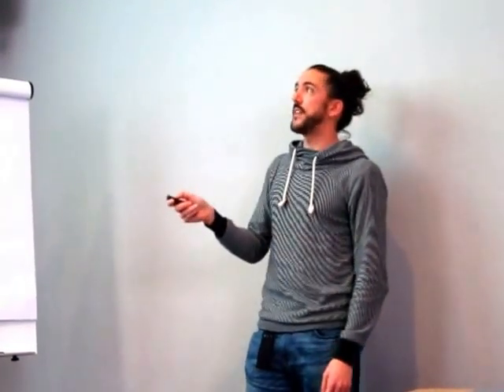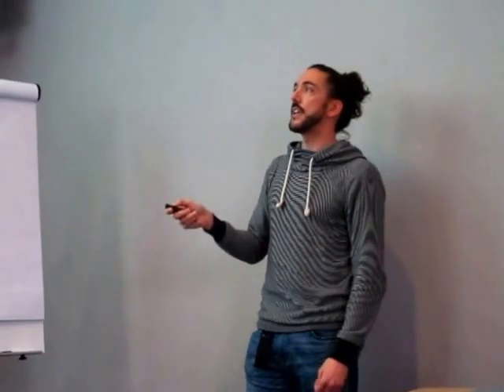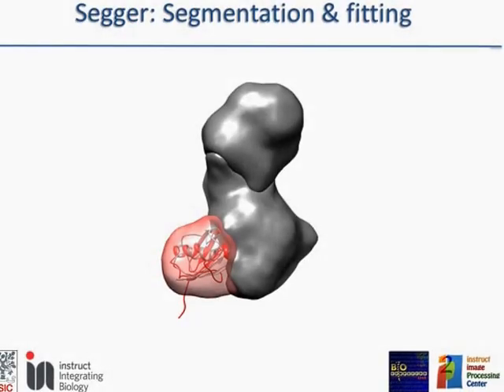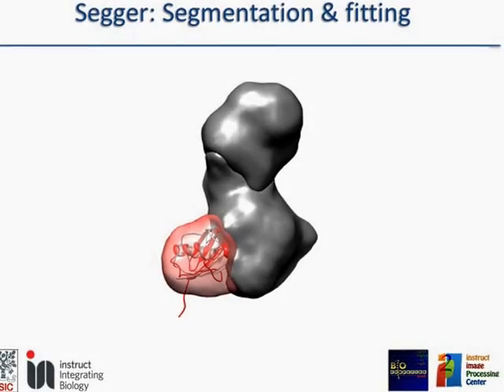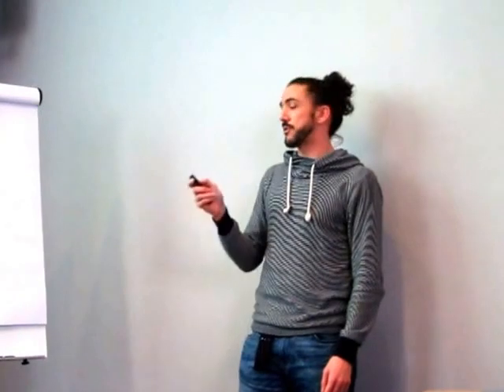Okay, so we have selected one by one the different regions and fit the corresponding subunit structures. In this case, it didn't work so well, but what is important is that in this algorithm, we have to choose the subunit in the region where we think that the structure will fit. In MultiFit, this was done everything automatically. This is a driven process.